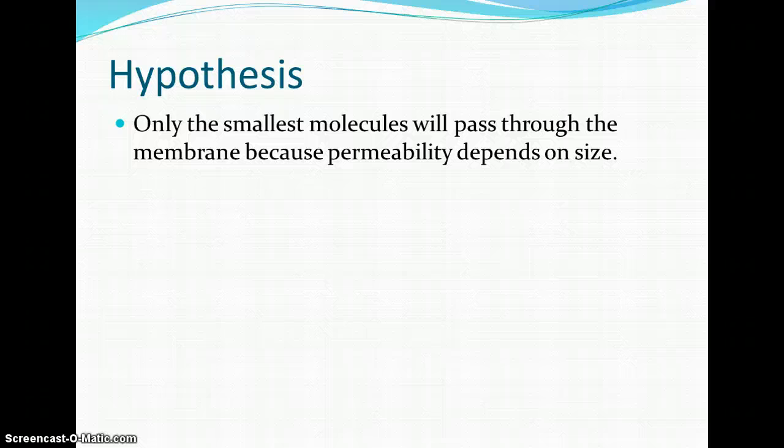And small molecules like sulfate and chloride, which we'll be working with, are small enough that they can just go right through the membrane.